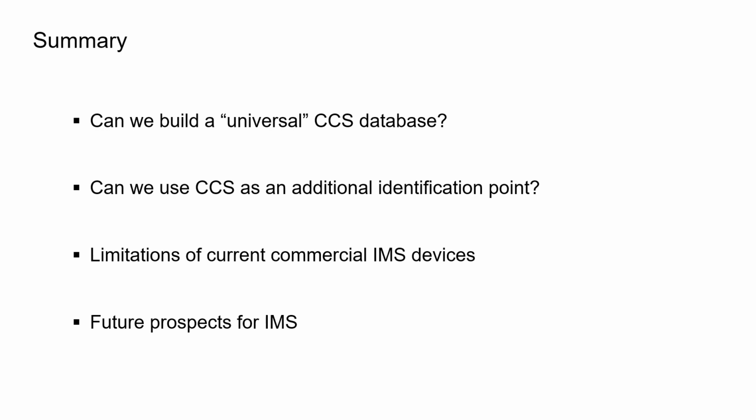I will then provide a critical view of the current commercial IMS devices, laying out their main limitations. And I will finish with a personal view of the current state of the art and future prospects of ion mobility.